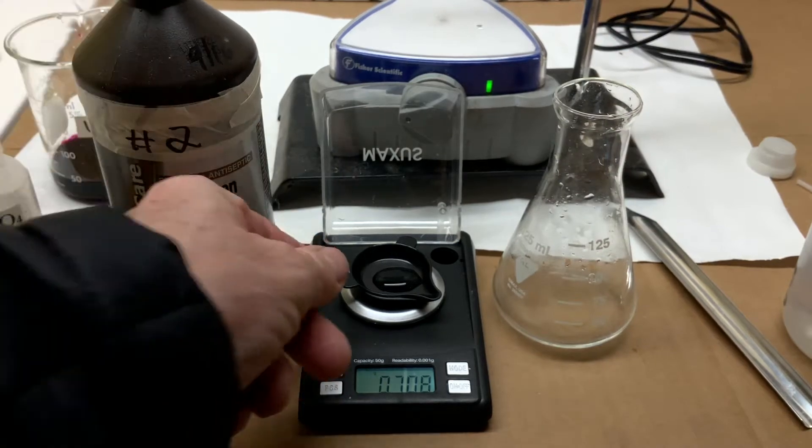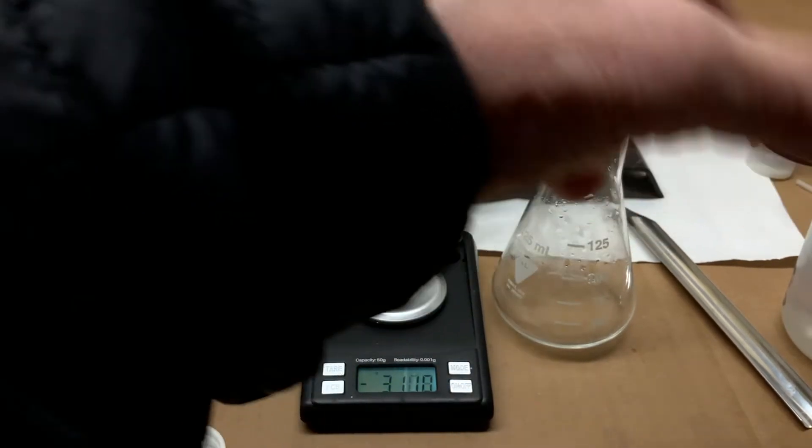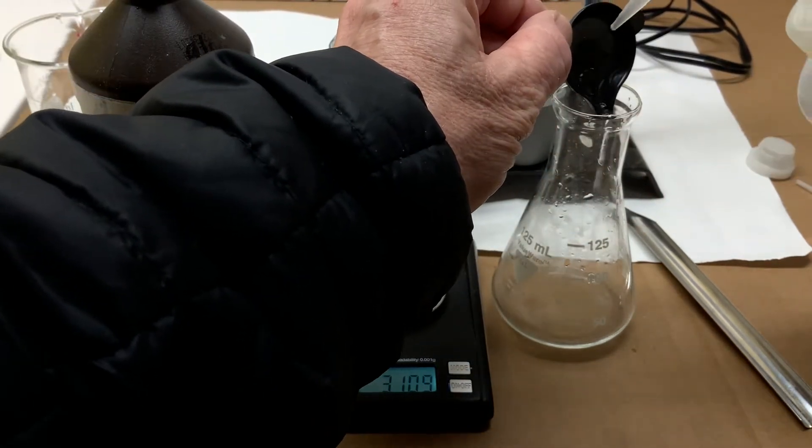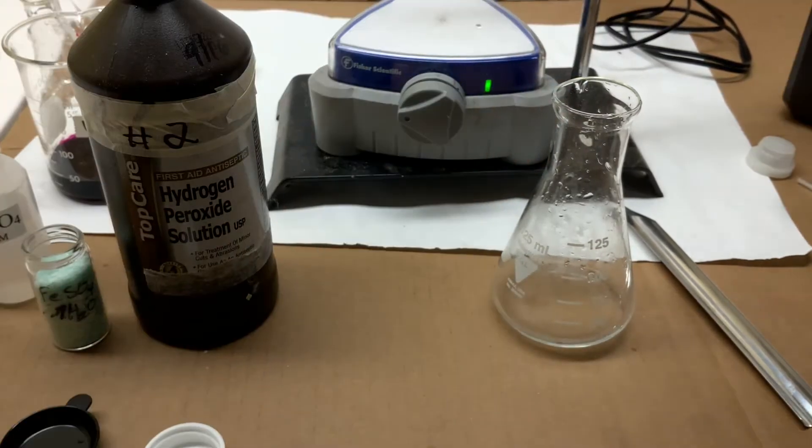I couldn't weigh the hydrogen peroxide in the flask because this balance didn't have a high enough capacity for the flask to be placed on it, so we'll transfer the peroxide to the flask using the wash bottle.